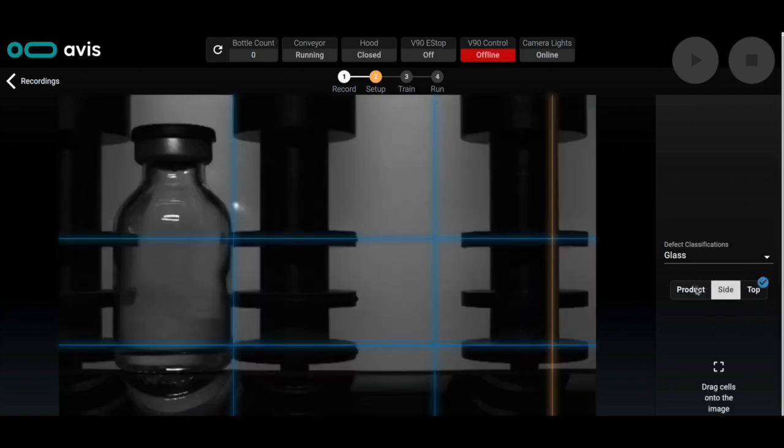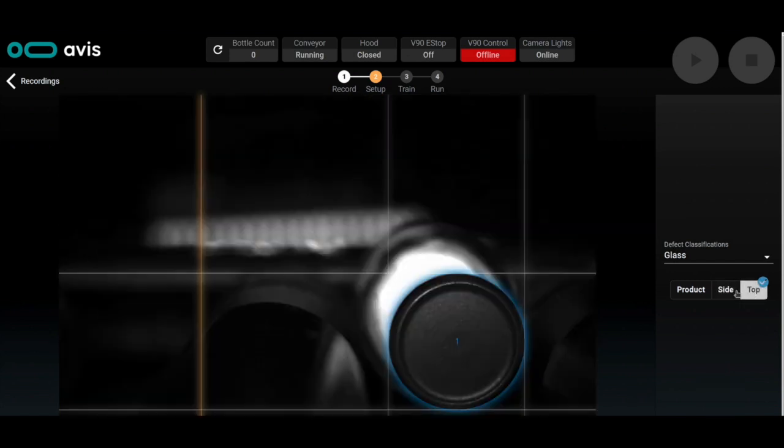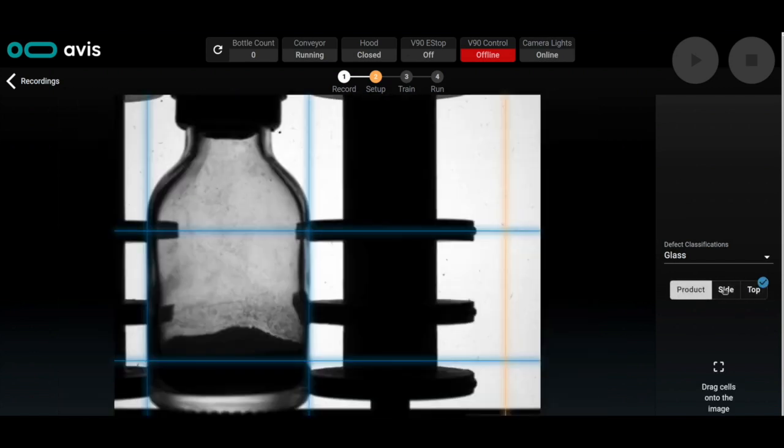All right, now the next thing to do, now that we've got the tracking model defined, oops, forgot a line here. There we go. So all those boundaries are set up.